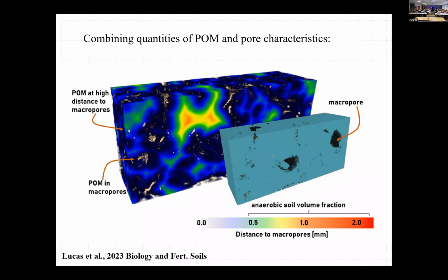That is a combination of POM images with pore images. The POM that was located far, according to our distance to pores characterization, the POM that was located in relatively anaerobic conditions.